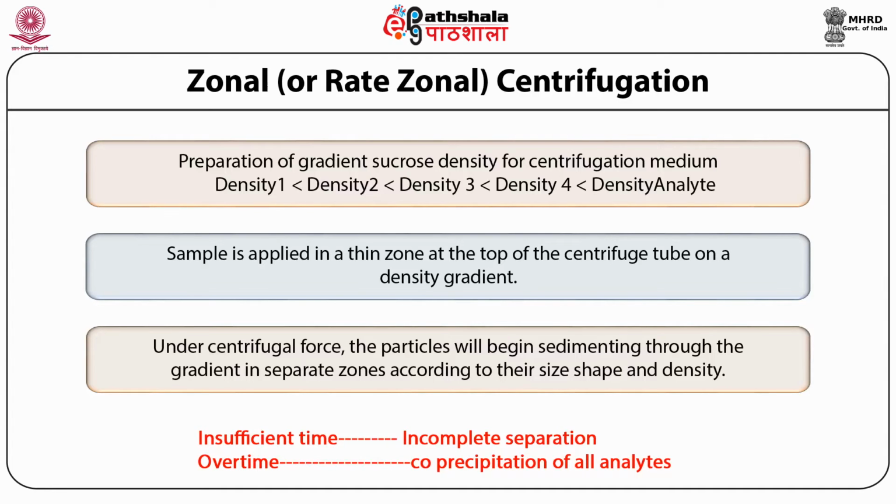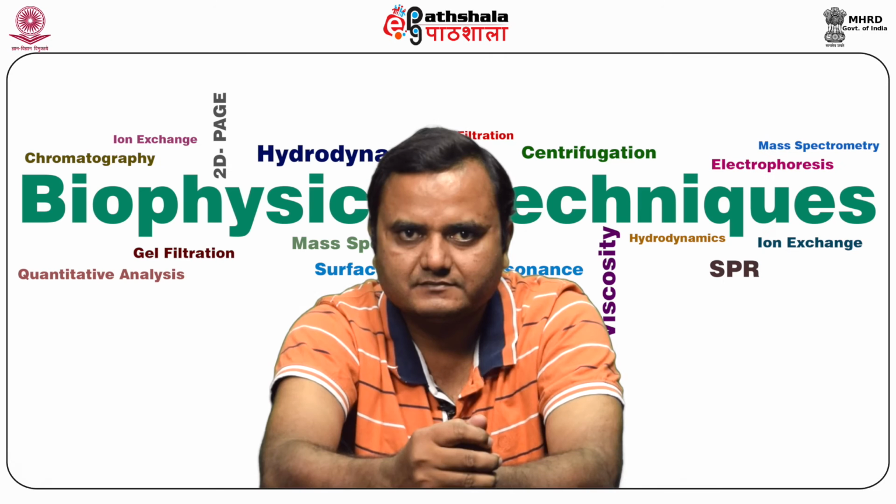In the same way, if you run over time, then co-precipitation of all analytes occurs. So there should be a very critical point to check the time, at what time you run, so that appropriately you can separate the sample and take it out.